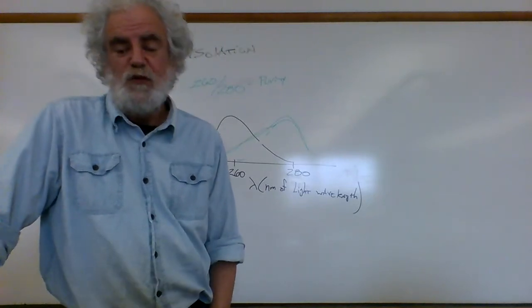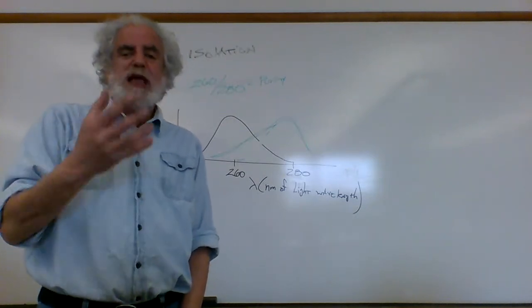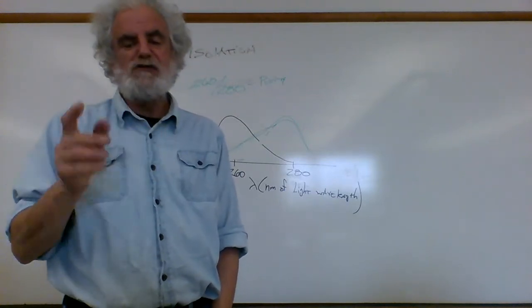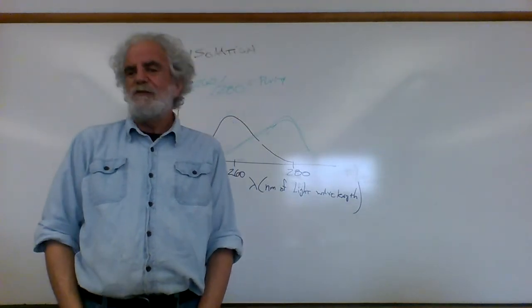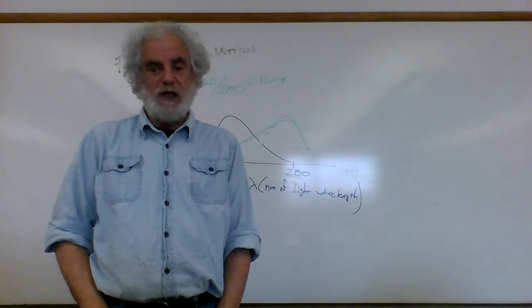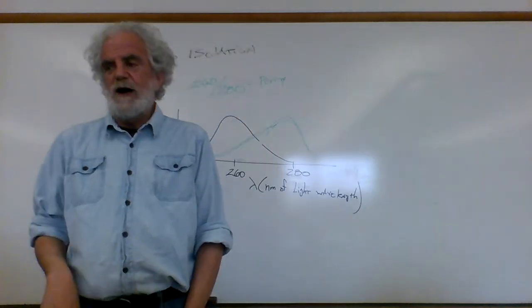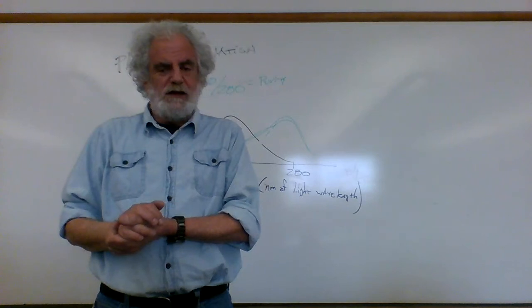And then next week, when we take this plasmid DNA and put it back into bacteria, you'll be able to calculate the transformation efficiency, which is calculated as the number of colonies per microgram of DNA. And so we'll be able to do a little bit of calculations and see. And so again, we have a friendly little competition. Who can get the most DNA? If you're keen on getting the most DNA, talk to me and I can tell you how you can cheat, and it works. So that's for lab this week.